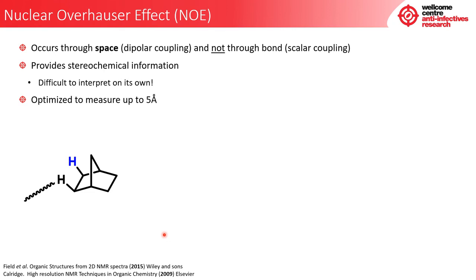As the radio frequency is applied to the source spin, what does this look like from an energy diagram? Well, in its happy state, before we have given it this pulse, you can see that there is a low energy state and a high energy state, and there are population differences between the two. Just from this happy state, there are a higher number present in the lower state than in the higher state. Something you should pay particular attention to is these numbers. These numbers are just arbitrary and are not a true reflection of the millions that will be located in each of these different populations.